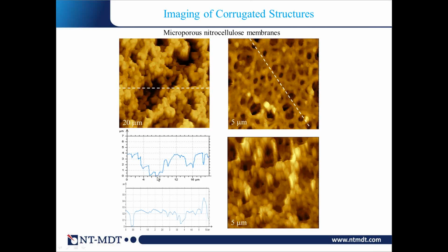And if you imagine the size of the tip is around 8 to 10 micron, that means you really need to have a very high aspect ratio tip not to touch the structures, especially in the holes, by the side of the tip. Unfortunately, that happens, and this is now the tip limitation.